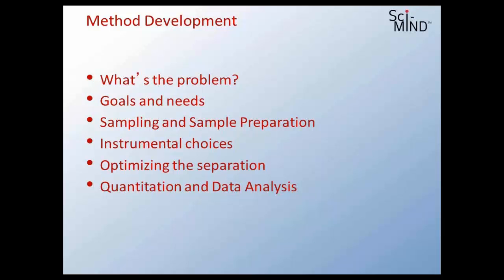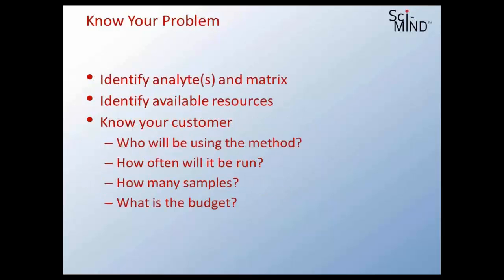We're certainly going to think, along with our chromatography, about sample preparation. I don't think we do any chromatography today without some amount of sample prep, and that also has an impact on what we're going to do instrumentally. Thinking about columns, how do we choose a separation technique? And then finally, I do have a few comments about data analysis. I've seen in the discussion among our Sci-Mind cohort this week that quite a number of you are interested in talking about different calibration techniques. So I put some introduction to that and a few comments toward the end. So that's where we're going to head, again broken up into two segments.